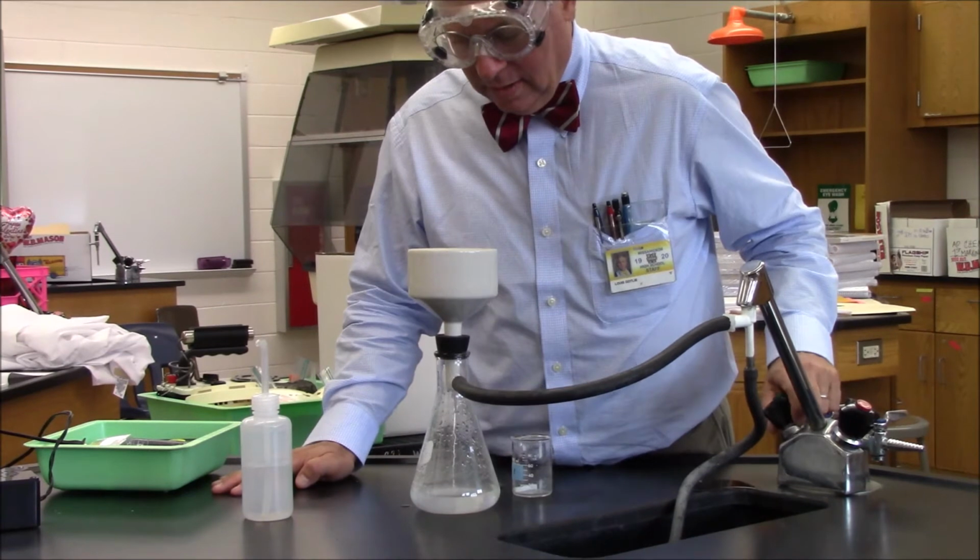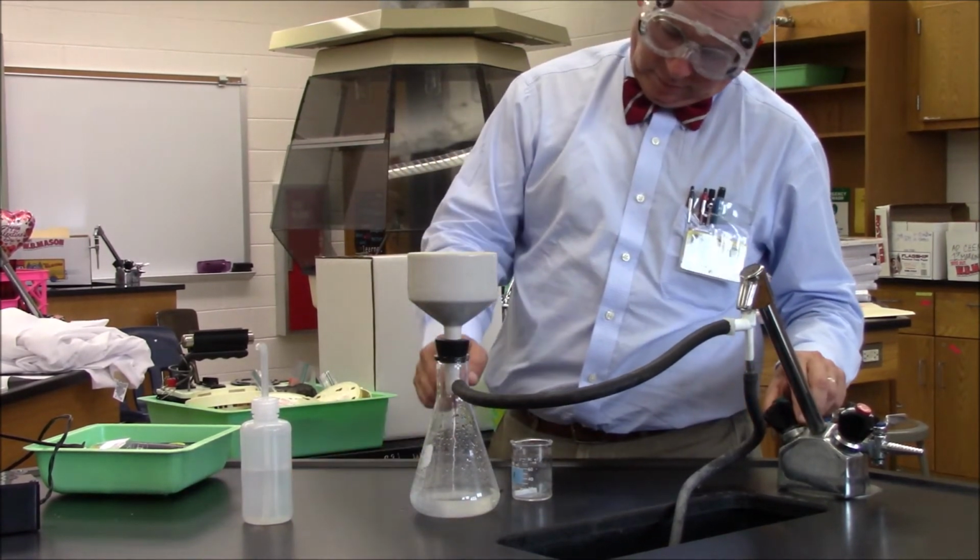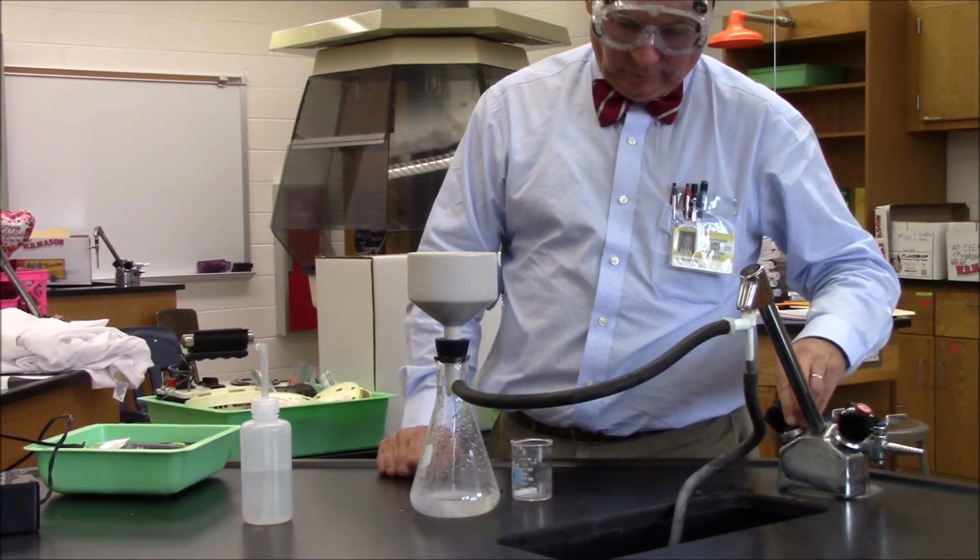Once all the water is gone, we'll stop, carefully remove it, and dry it before we weigh it. Thanks, Mr. Gottlieb.